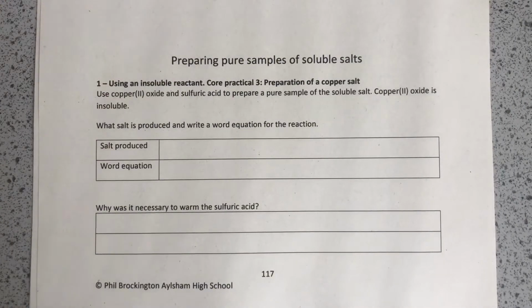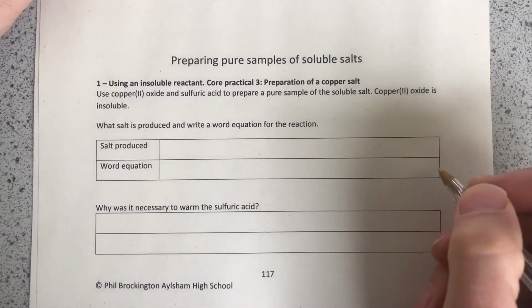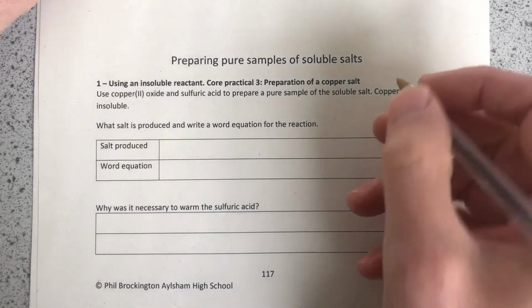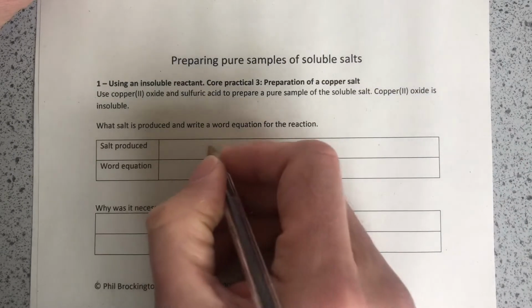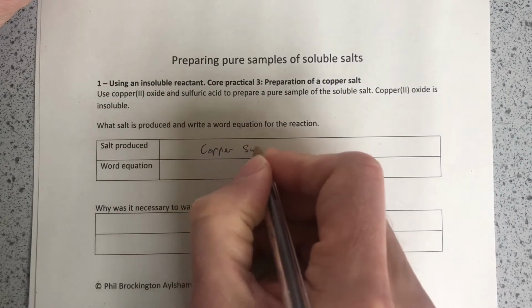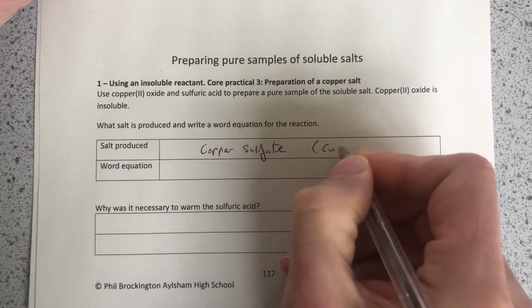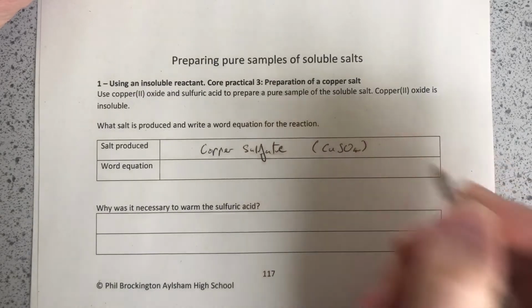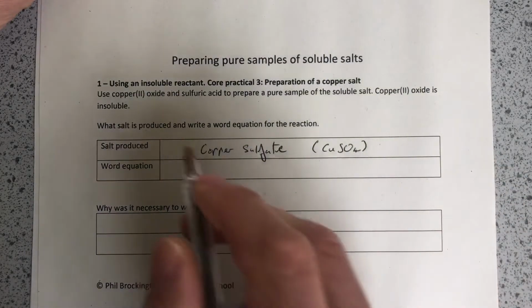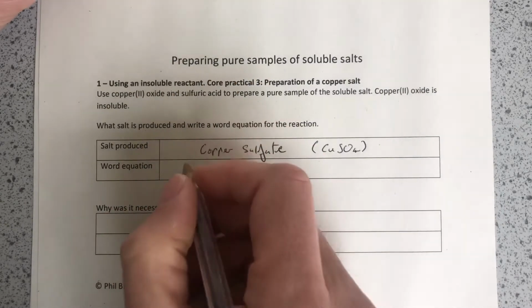This video is about our third core practical in Year 10, and the aim of the practical is to prepare a pure dry sample of copper sulfate. So that's the salt that we're going to produce, copper sulfate, and I'll put the formula there as well, CuSO4. We're going to produce that from an insoluble reactant, and the insoluble reactant is copper oxide.